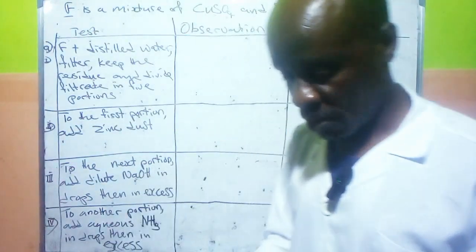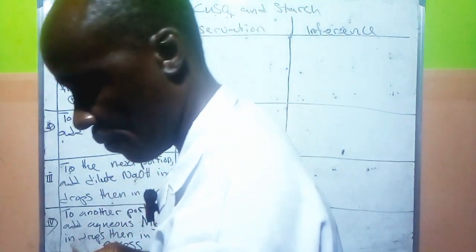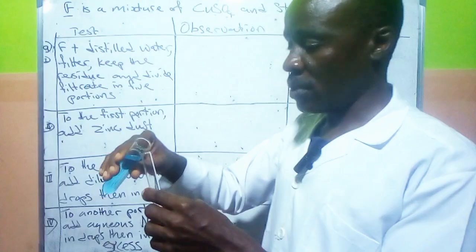And then what I will do now is to divide into 5 portions. Let me quickly do that.